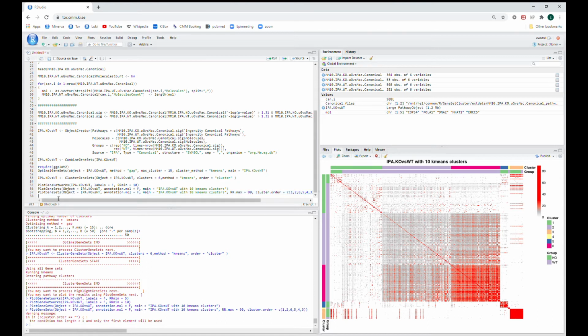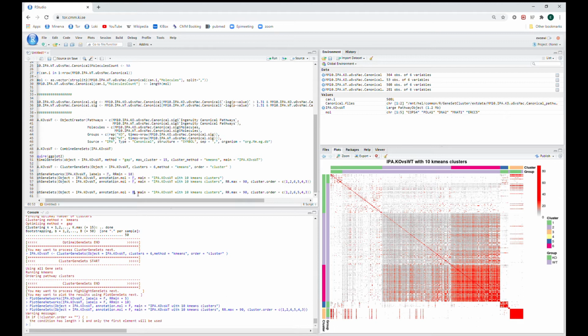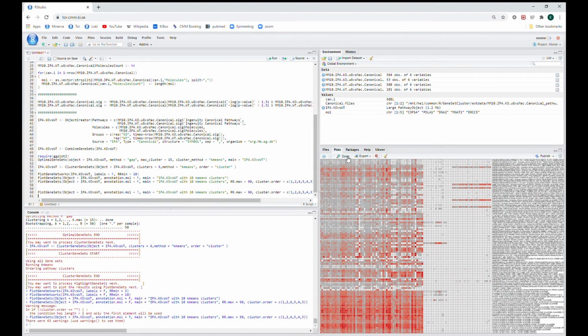All right, so now we know kind of what we want to show. How do we read this? How do we sort of get functional information out of this? Well, we can say we want an annotation of the molecules, and what that does is it's going to make it a little bit less legible in R. If you write it to PDF, it usually works a lot better. And you can play around with the size that you want.